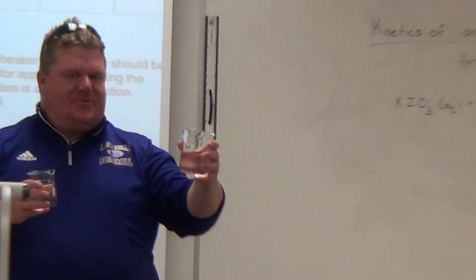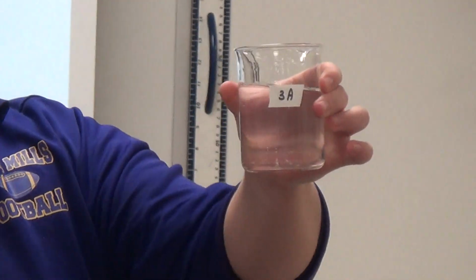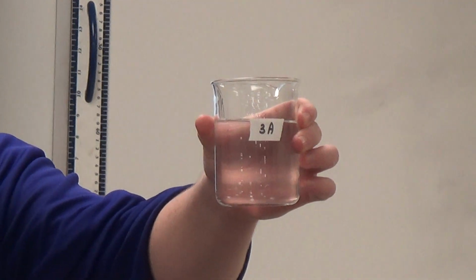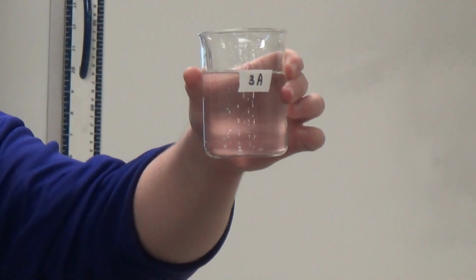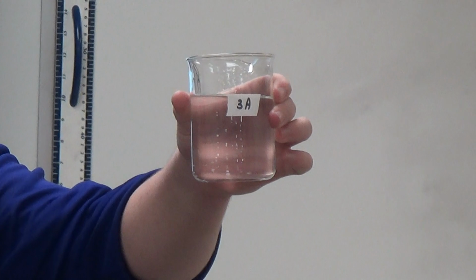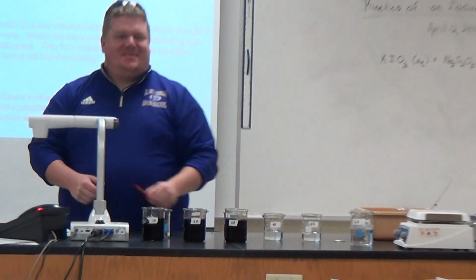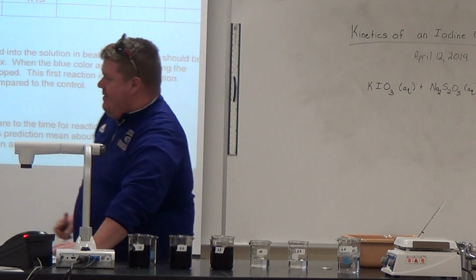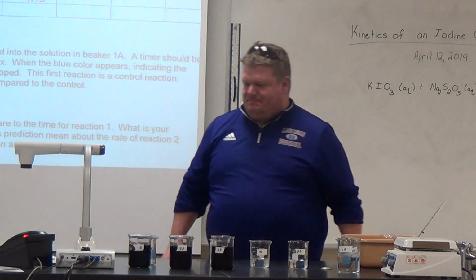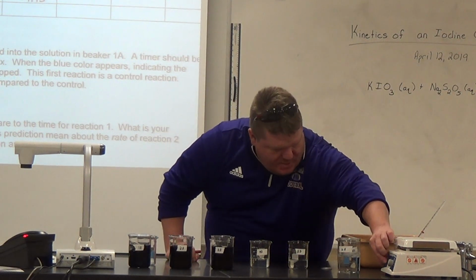So 3B into 3A. Ready, Adam? Yep. Okay. It's a lot slower. 19.1 seconds. Yeah, that's pretty close to it. How much was it? Felt like forever. 19.